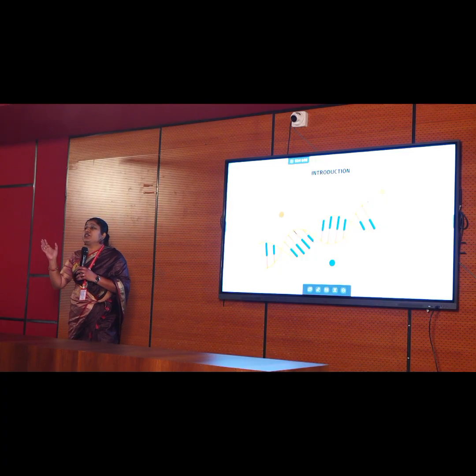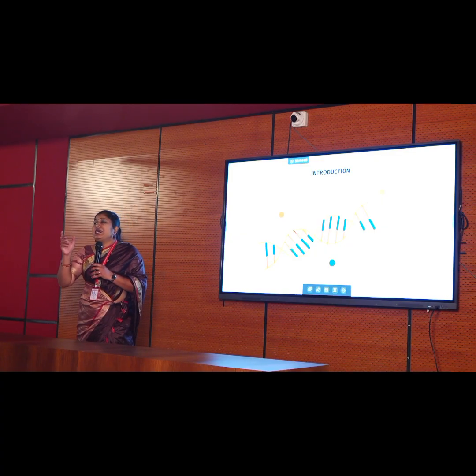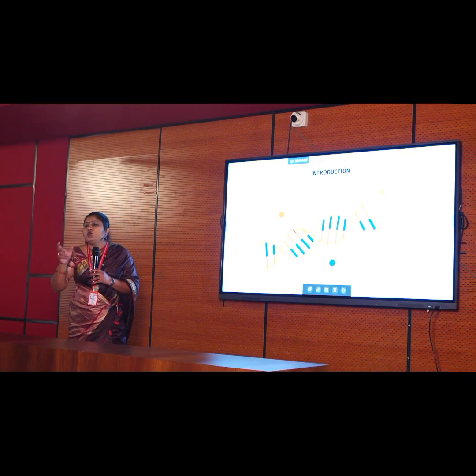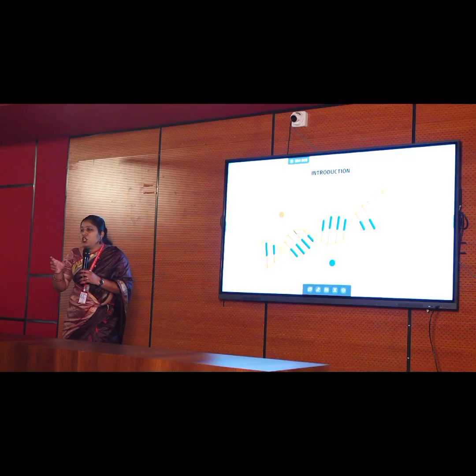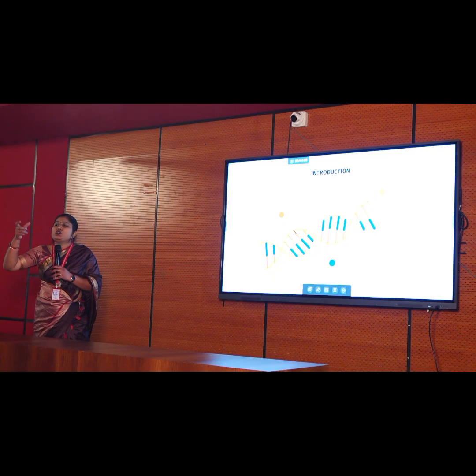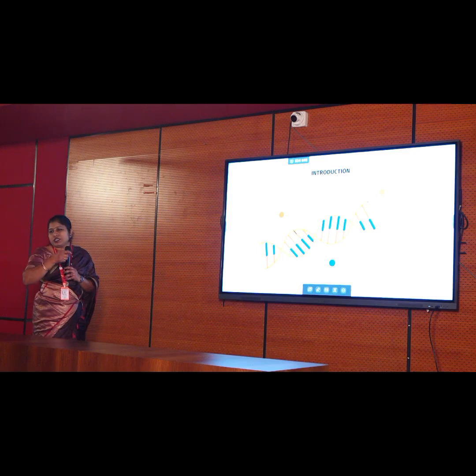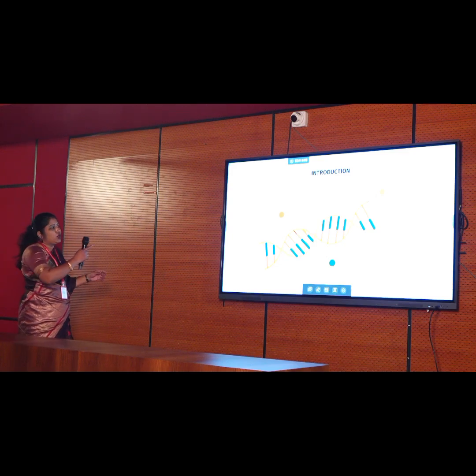It becomes theoretical in the sense that it is difficult to grasp, because this basically deals with molecular biology, as DNA is a macromolecule which is present in the nucleus of the cell. So we have extracted that DNA and we are going to show it to the students. Actually the students have done their work, extracted it and showed how exactly the DNA looks like. So this topic belongs to cell biology which we have taken on.